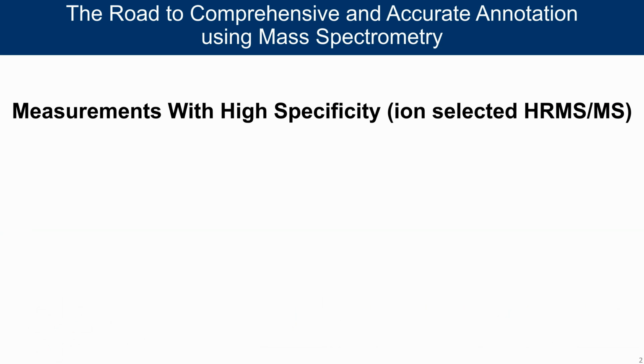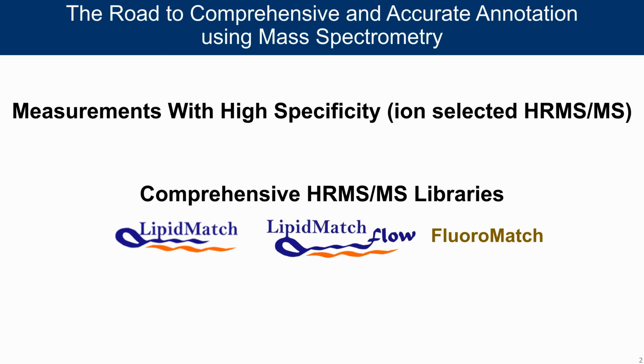We are in the midst of the omics revolution. In this revolution, instead of measuring a few compounds based on a specific targeted question, we are now able to understand an entire system by measuring thousands of molecules across different classes, whether it be lipids, small molecules, contaminants, proteins, or genes. This revolution is possible because of mass spectrometry, specifically high-resolution mass spectrometry, whereas tandem mass spectrometry provides unique and universal information that can give structural information on any type of compound that's ionized.